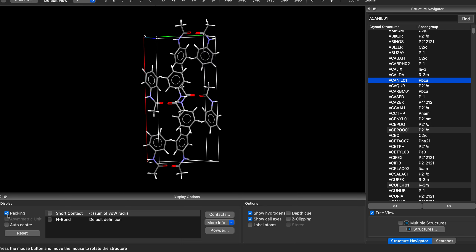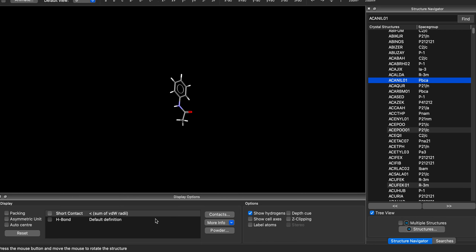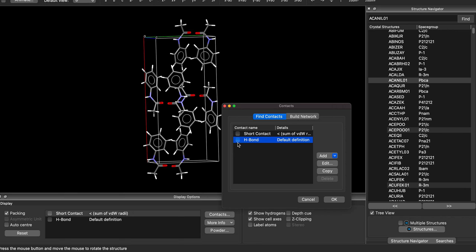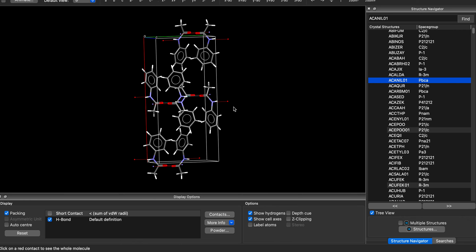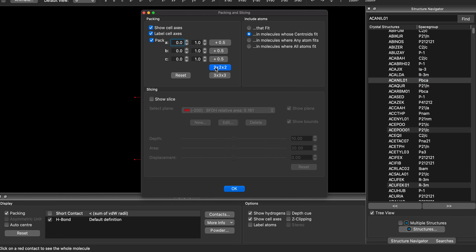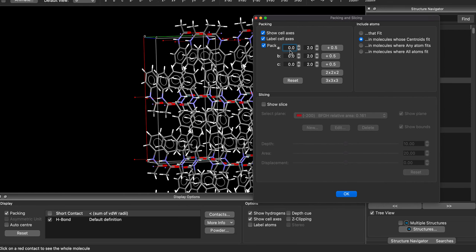Here I already have some data entries loaded. You can create packings just by clicking this, and you can see contacts such as hydrogen bonds or short contacts. If you want to do larger supercells, you can go to Calculate > Packing and Slicing, and then you can do 2×2×2 or 3×3×3 or whatever you want along any directions.